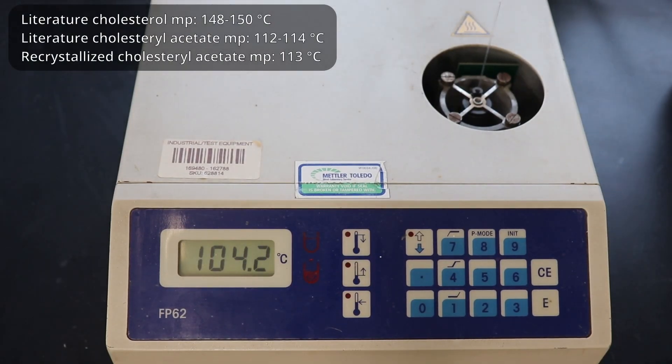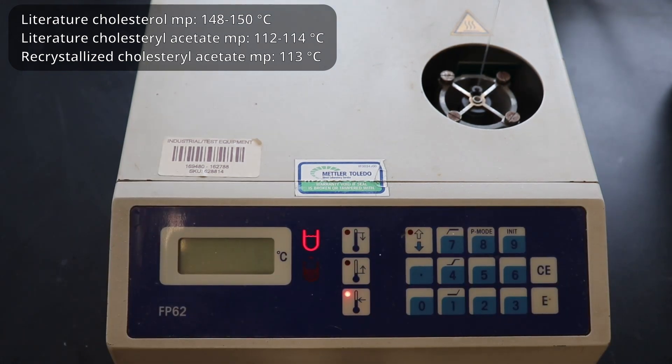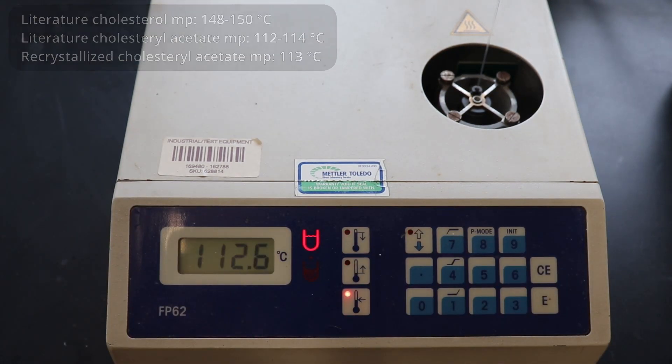So the first test I did to characterize my product was the melting point. My product melted at 112.6 degrees celsius, which perfectly fits in the literature melting point range for cholesterol acetate of 112 to 114 degrees celsius.